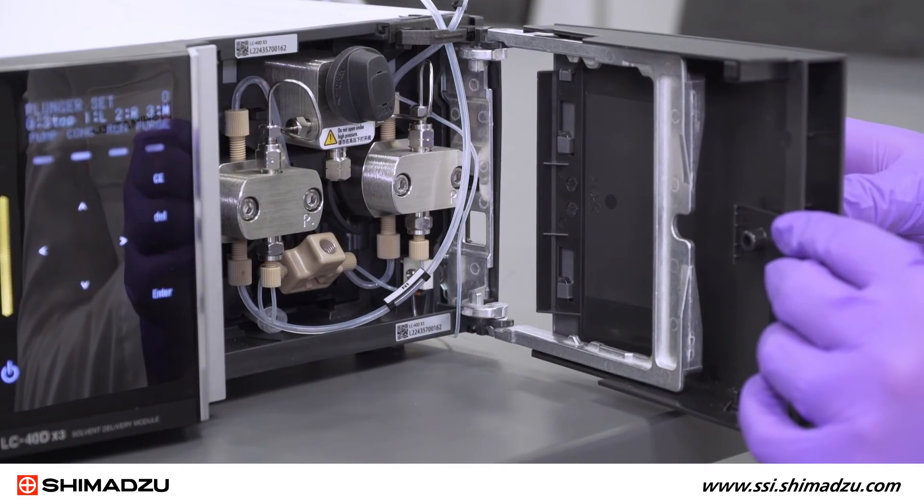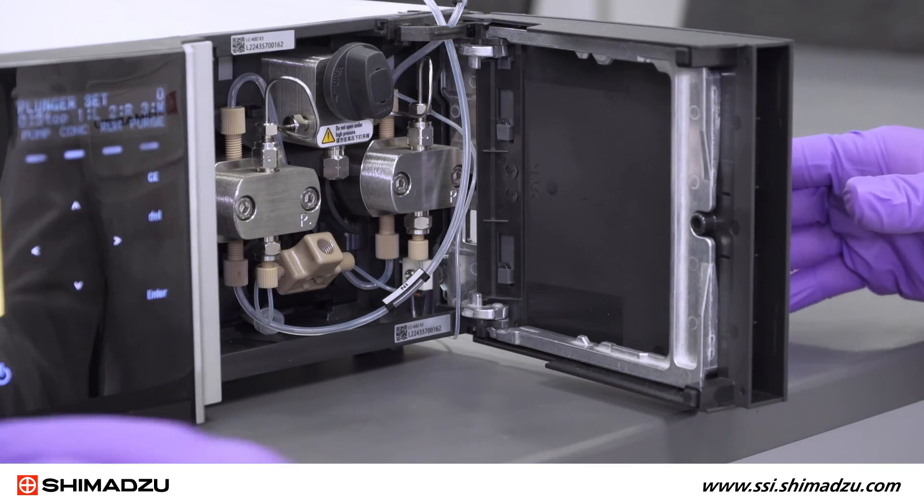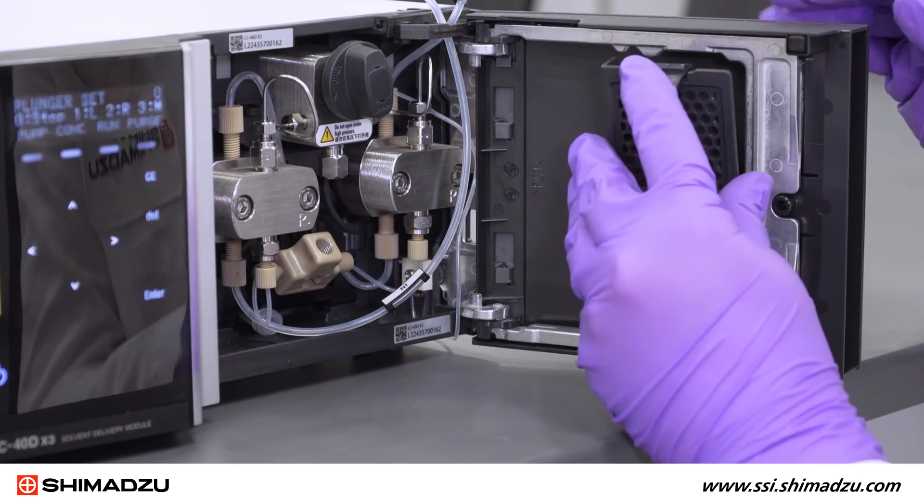Finish the procedure by reassembling the right pump door. Slide on the panel cover until it clicks into place, then replace the filter holder.